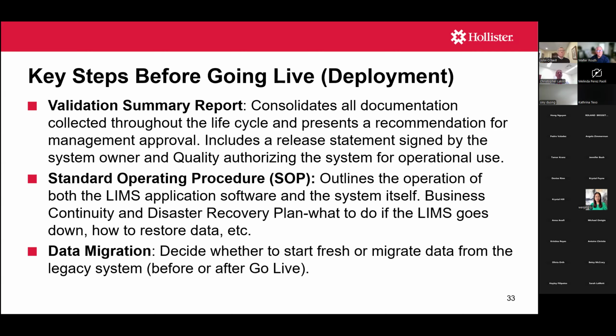We had a lot of data in Excel spreadsheets. So did we want to import all that data into the stability LIMS system when we were going live, or were we just going to draw a line in the sand and say, well, we archive the historical stability data. Anything from this date on goes into the stability LIMS system. So that's something important to consider.